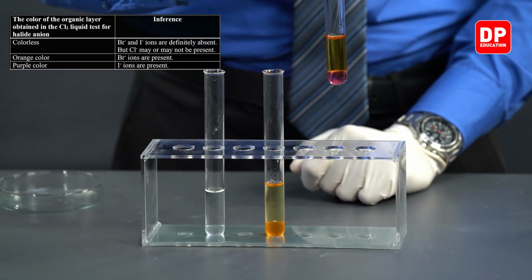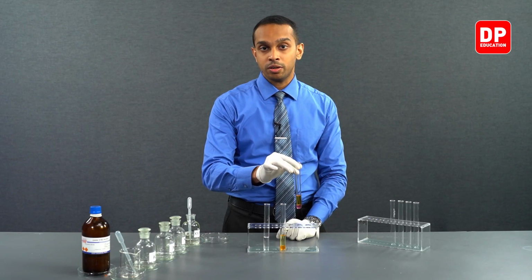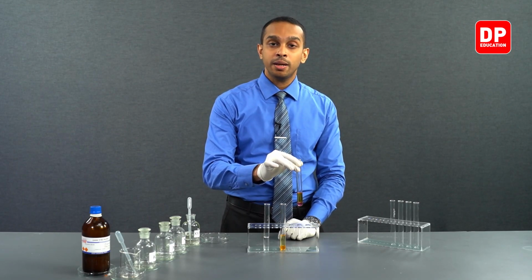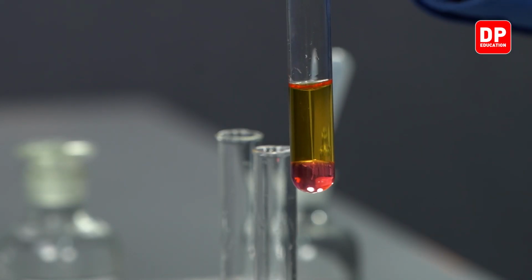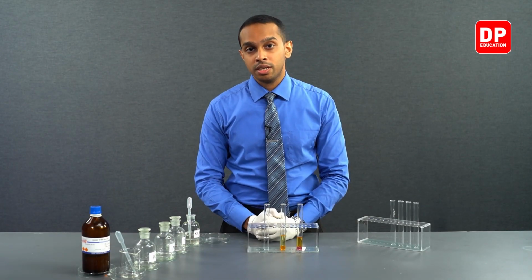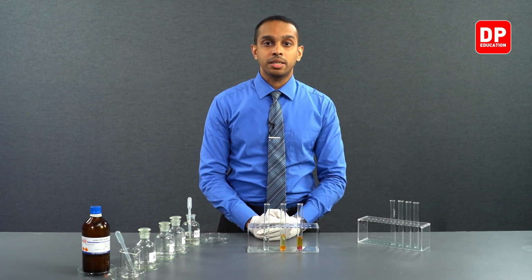This purple coloration indicates the formation of iodine, I2, and dissolving of iodine in the organic solvent layer will turn that solvent purple. So these are the observations when we conduct the chlorine water test.